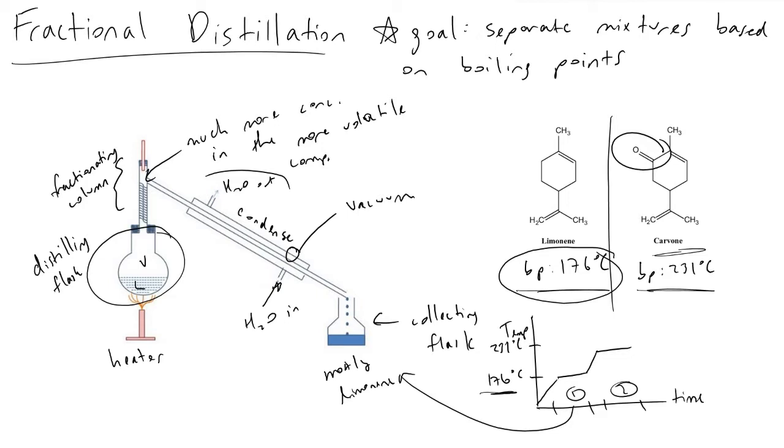So if you have very high pressure on a liquid, it will not want to escape the liquid phase and enter the vapor phase because the vapor that's present in that container is pushing down so hard on it. And so by removing the other molecules present in the vapor phase, you're creating an incentive for molecules in the liquid phase to want to enter the vapor phase. Consequently, less energy needs to be supplied, and this helps us.